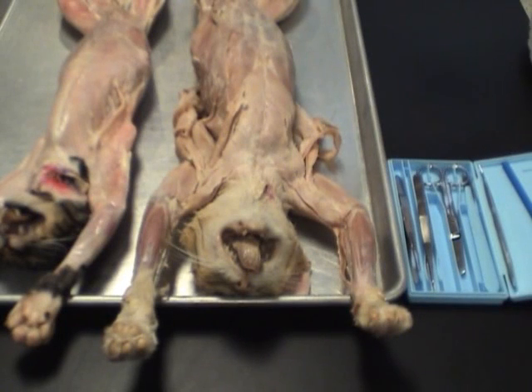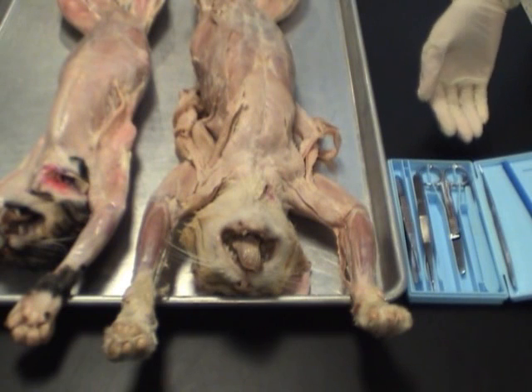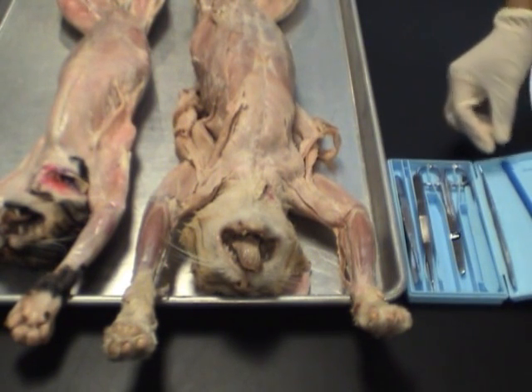Okay, let's start by talking about the instruments you'll be using to dissect the cat. And I'm going to go through each instrument and describe to you how to use them. Okay, so let's start with the probe.